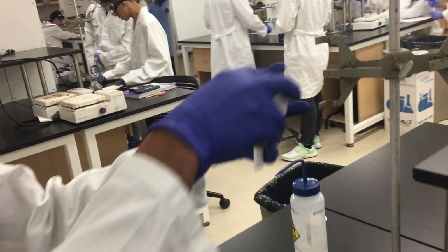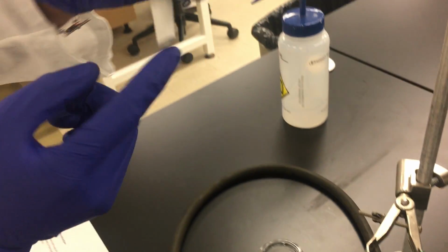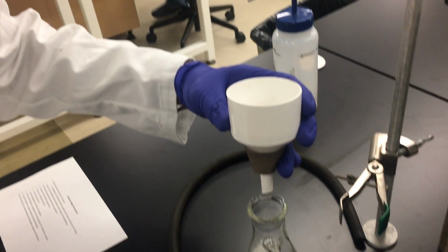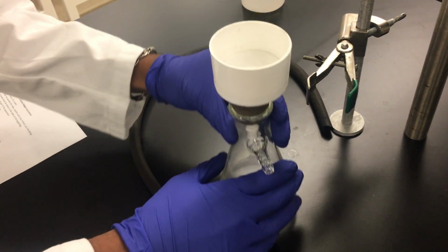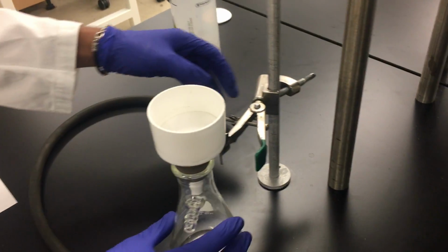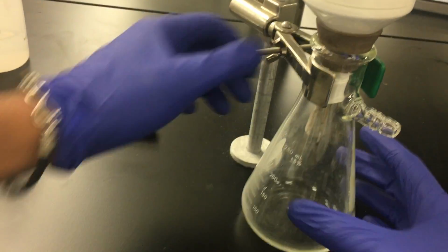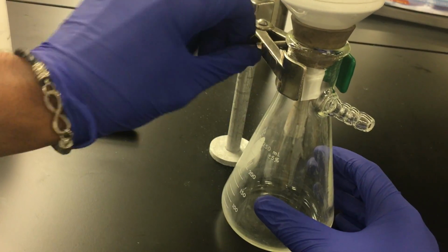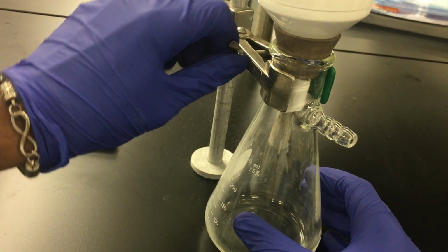From here, we're going to insert the funnel into the flask such that this side, which is open and slanted, is going to be facing the side of the suction. So we're going to insert it like that. There we go. From here, what we're going to do is clamp this to the stand. And we're going to clamp it and have the filtration system sit right here.